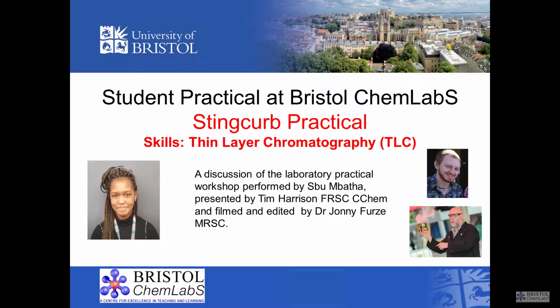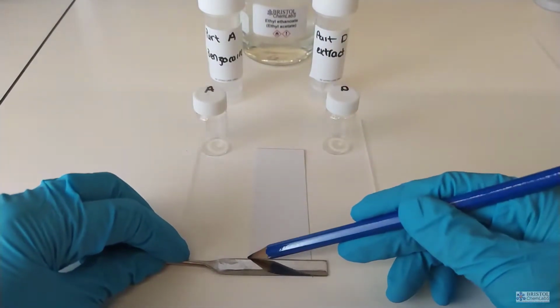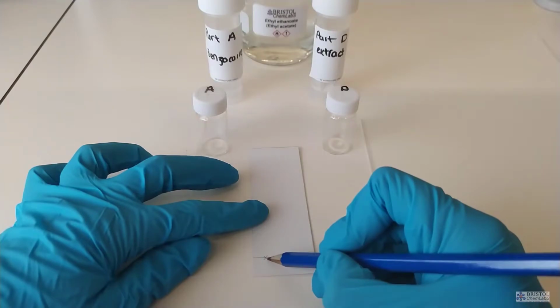One way of looking at the purity of the product formed in this synthesis is to use thin layer chromatography, which gets abbreviated to TLC. The TLC plate that is used contains alumina that has been treated with a fluorescer. The alumina itself is stuck either on the back of a plastic or aluminium support material.